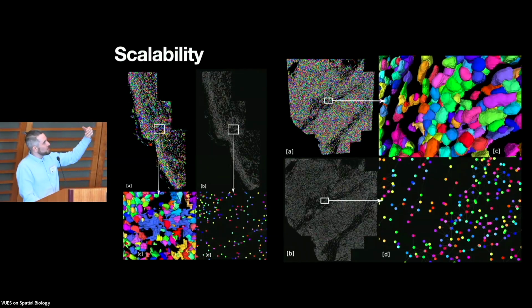And now, of course, this invites us to also go towards these analysis processes that we've heard before from Clarence. How do cells collocate? What is happening between cells? Who is touching each other? And what communities or bigger networks do they form? At the step that I'm currently showing, it's randomly colored, but of course we're thinking of using cell type annotations to really see a nice overview of where they collocate, and to go to these abstractions that you mentioned, like Peter Sorger is drawing or pulling together in PowerPoint.